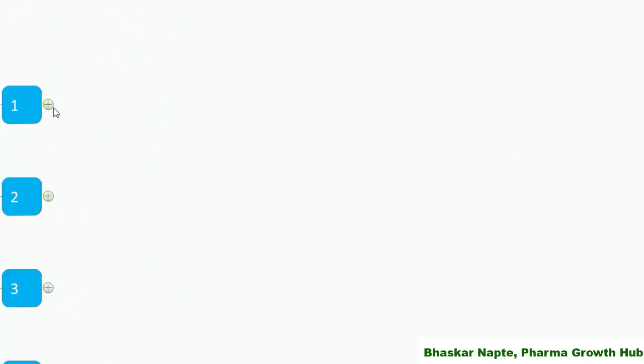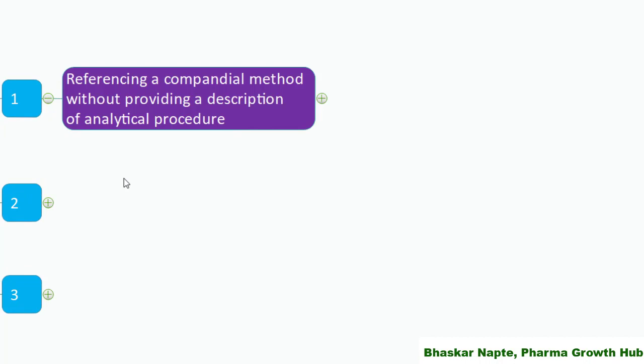Point number one: just referencing a compendial method without providing a description of the analytical procedure is not going to suffice. You cannot say for the assay of XYZ product, refer to USP monograph so-and-so. You need to also provide the details required so that the chemist or analyst is able to perform the analysis and does not need to refer to the USP monograph.